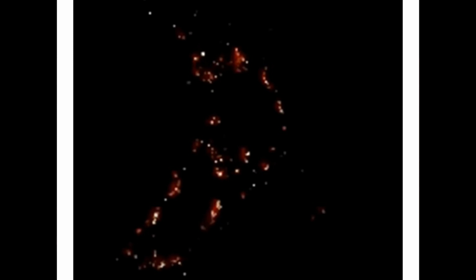Whereas in the movie, you saw this hugely pixelated blinking image, after reconstruction, we can get a very high resolution image because we are only seeing a few dyes at the same time, and we're not looking at everything at the same time.